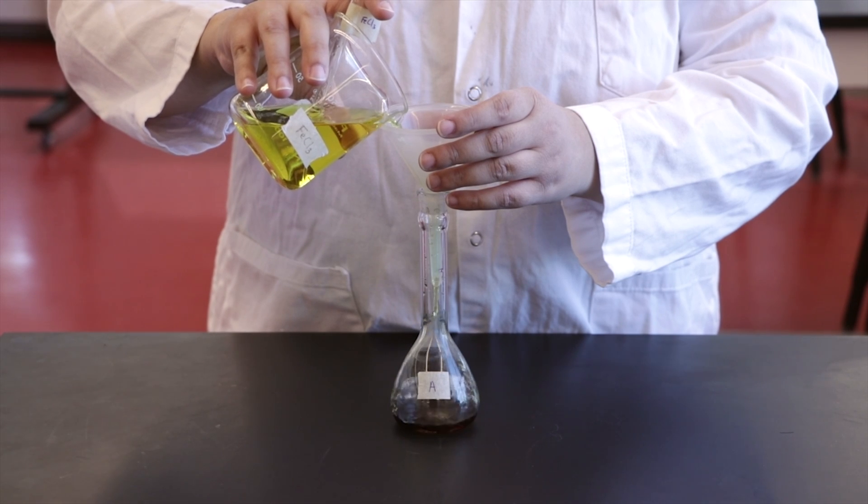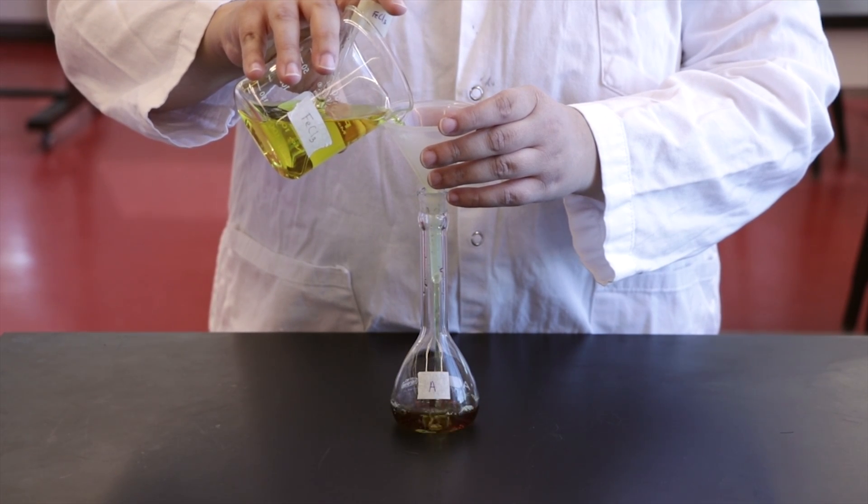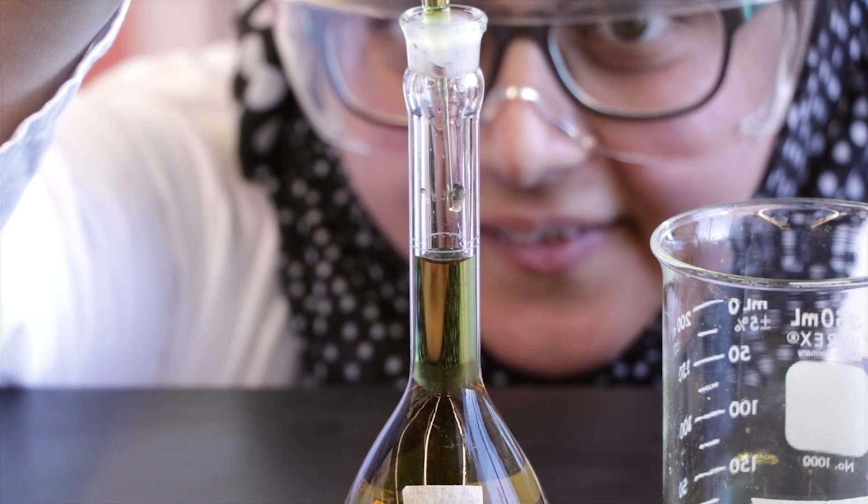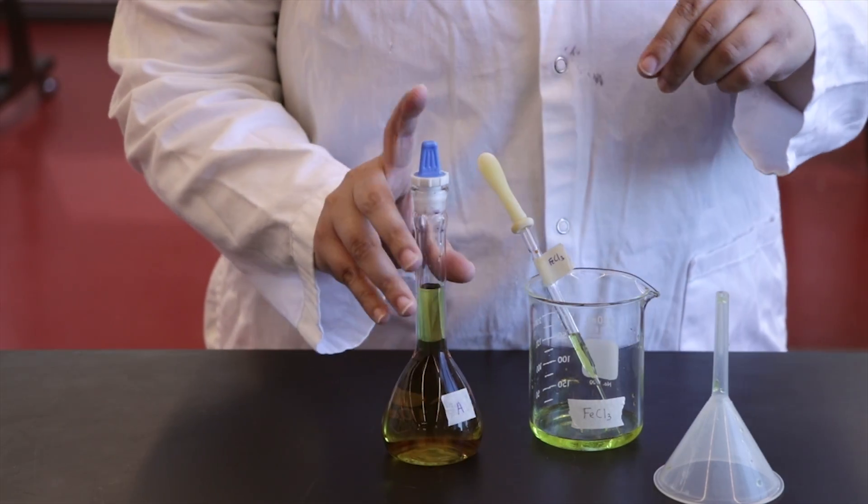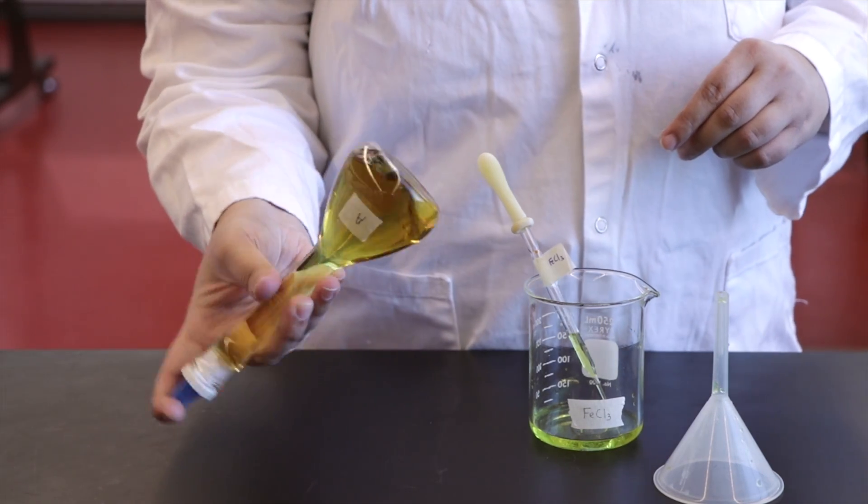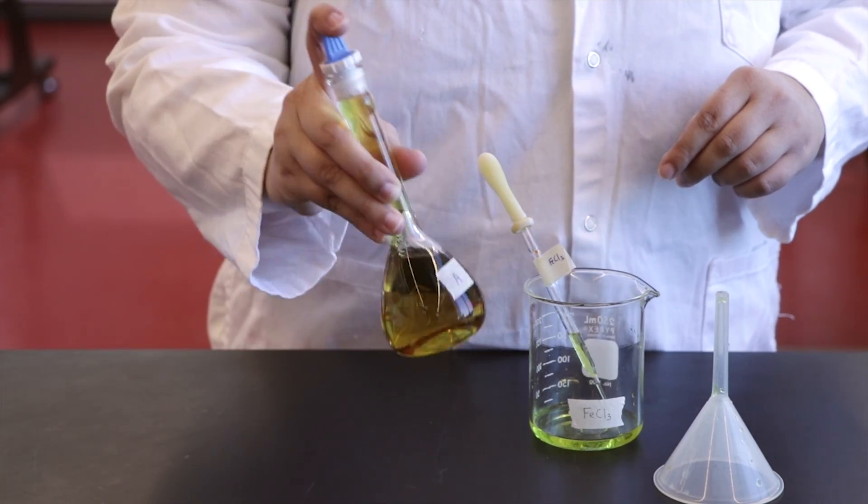Carefully fill each flask to the 100 mil mark with the acidified 0.02 molar iron chloride solution. Invert each solution 20 times and record the percent transmittance of each solution as soon as it is prepared.